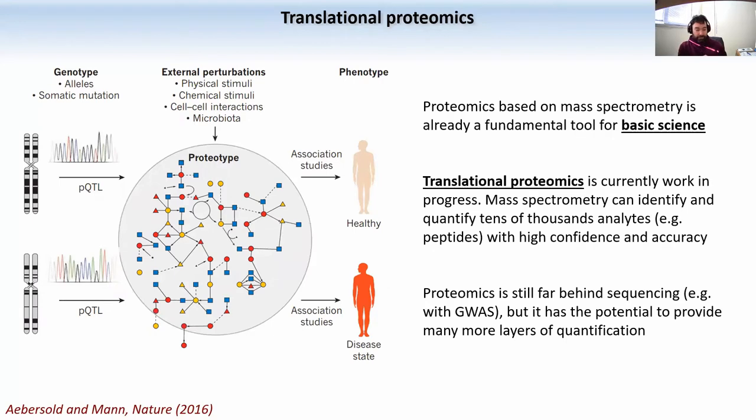And finally, just a couple of slides about the applications for proteomics. So proteomics is widely used in basic science. I think nearly every institute has a proteomic facility where proteins are being analyzed, usually some lab that takes care of that. But you also find proteomics, for example, in the hospital. And people use proteomic analysis attempting to basically screen for phenotype of patients. This is just how it would work in theory.